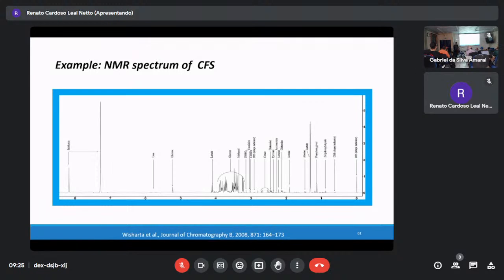But it's not like urine, right? Saliva means enzyme is there, right? That's why you precipitate with the acetonitrile, and the supernatant is used. No proxy, straightforward. Of course, saliva also has very individual variation.